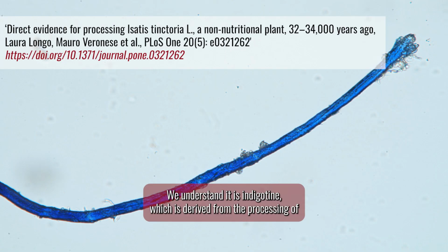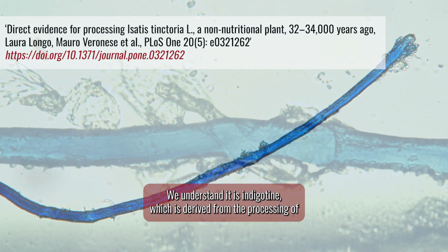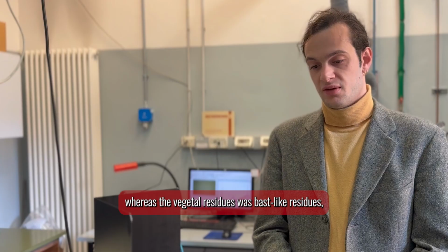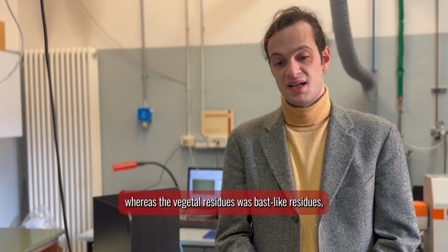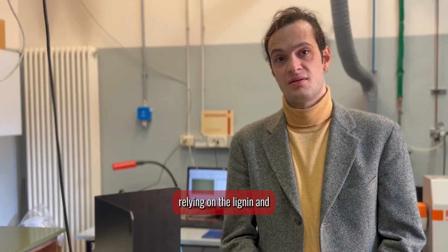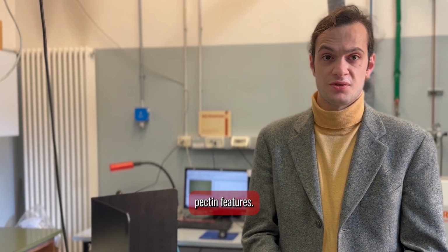We understood it is indigotin, which is derived from the processing of Isatis tinctoria leaves, whereas the vegetal residues were bast-like residues, relying on the lignin and pectin diagnostic features.